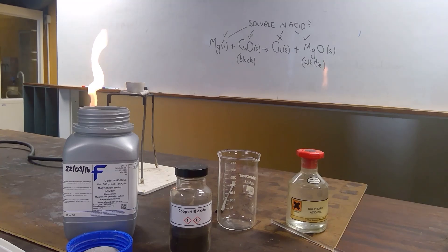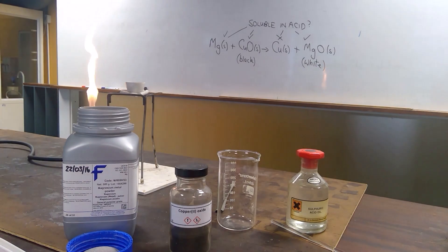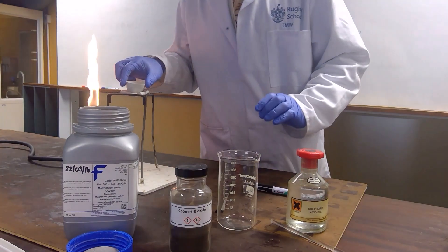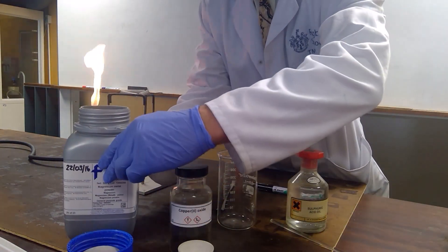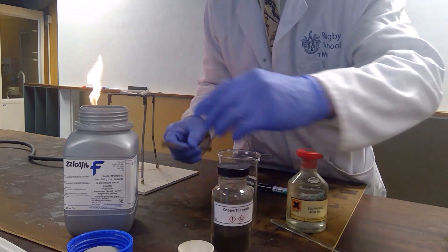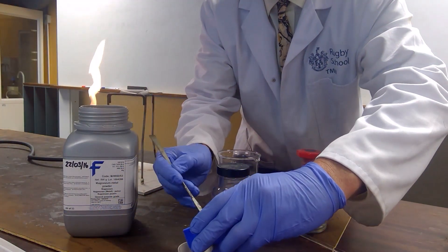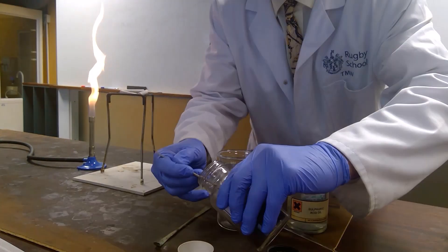The reaction is done in a crucible, and the magnesium powder and the copper oxide are intimately mixed. First, the magnesium powder is placed into the crucible. This is combined with a similar quantity of copper oxide.